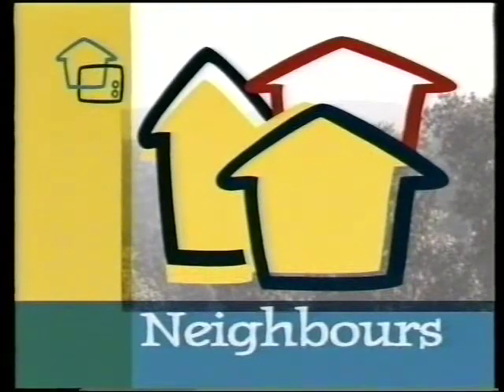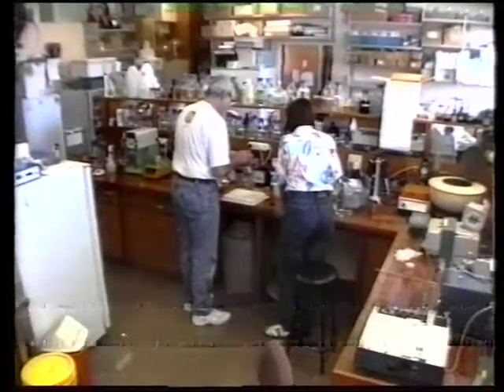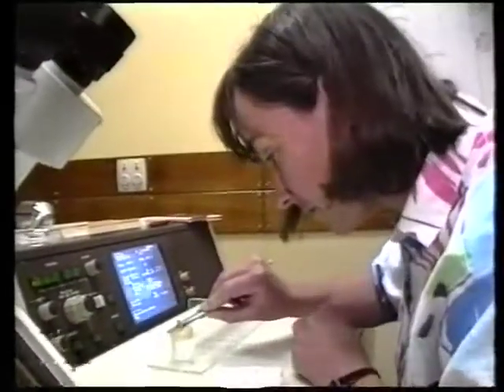Ecology is a touchy thing, and with various shellfish around our harbours currently under attack by viruses, we took up Waitarua scientist Paul Scotty's invitation to drop into work and peer down his microscope. There's an infection of shellfish, and we think it's caused by a virus.